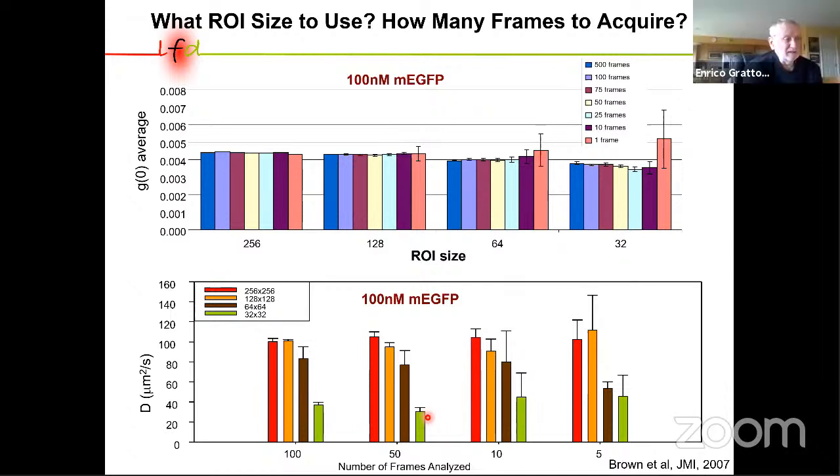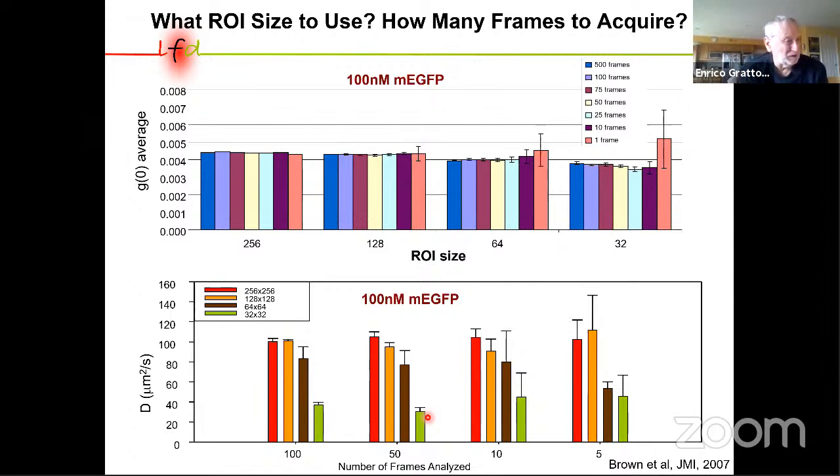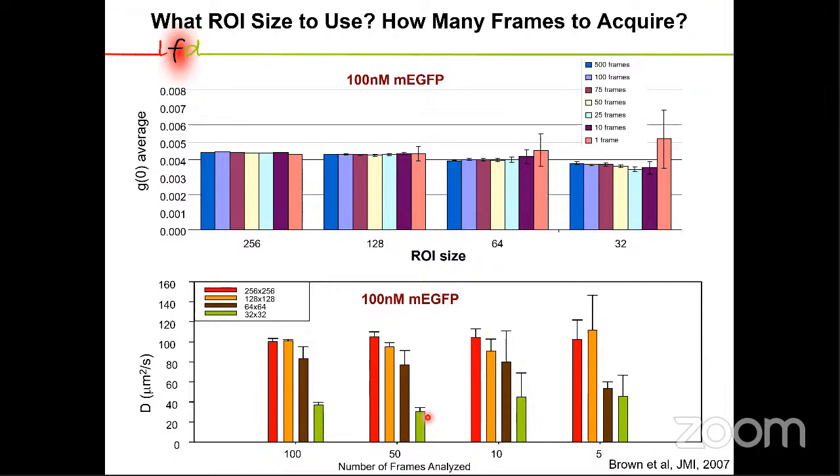But the issue of using an arbitrary region to do RICS is defeated by this principle. So in general, you cannot use an arbitrary region. If you have a very narrow filopodia or whatever, you cannot do RICS in that filopodia. It will be very difficult. Well, it's not difficult to do, but you bias the result. It will give you a wrong value, right?